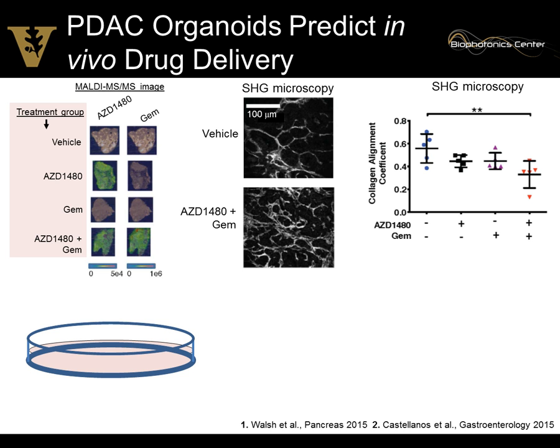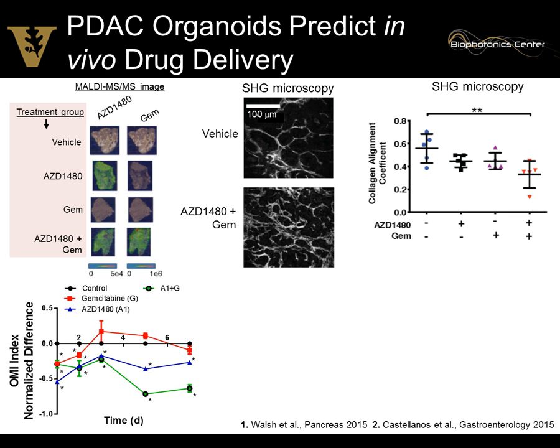So that's good. So this was all done, again, in tissue sections taken directly from the animal after it was euthanized. So in a separate cohort, again, we had tissue samples that we grew in 3D organoids, and we looked specifically here at the fibroblasts. So this is a drug-responsive fibroblast to gemcitabine, the JAK inhibitor, and then the combination.